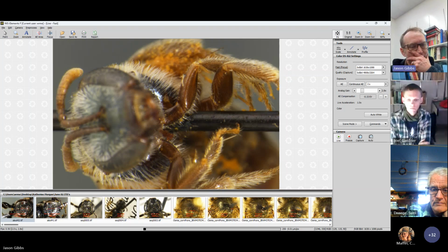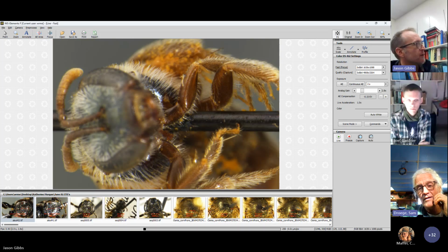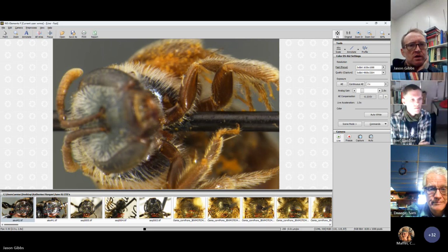That's really interesting. But before I get to this, I just wanted to show what is on the screen right now. That is a trigeminum and a trigeminum trochanters. So a little bit wider perhaps than the oblongum that we just saw. Certainly, but not as insanely wide as the callidum, or certainly not the connexum.